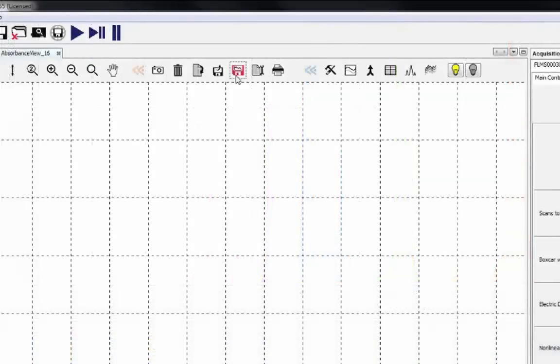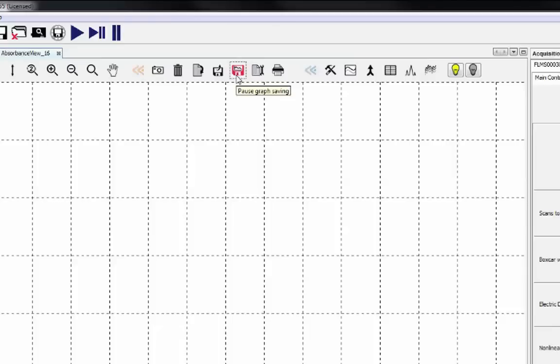If you'd like to stop it saving part way through, simply click the save icon a second time and it will go from red to black, indicating that saving is no longer in progress.